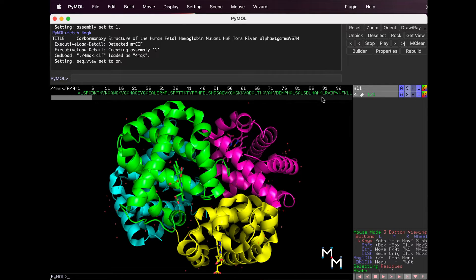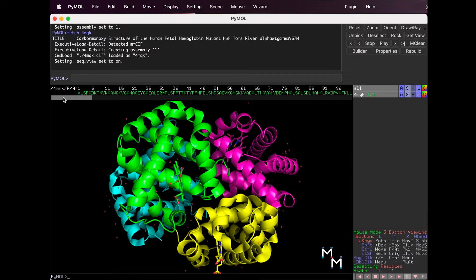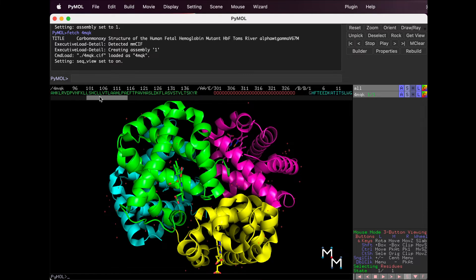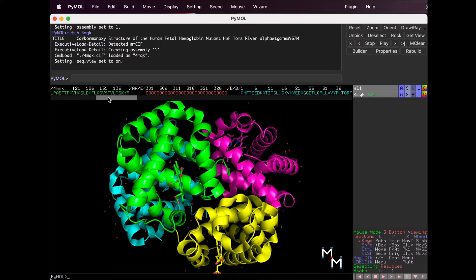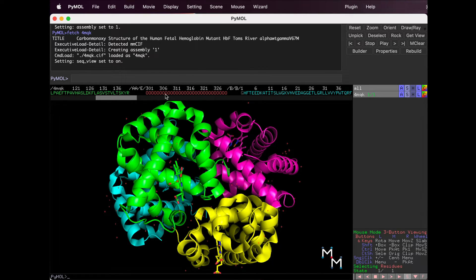This gray bar here is a scroll bar. Let's look at the whole sequence by clicking and dragging on it. Following the first chain, we find a string of O's, the oxygen atoms in water molecules, which show up as red dots in the structure viewer here.